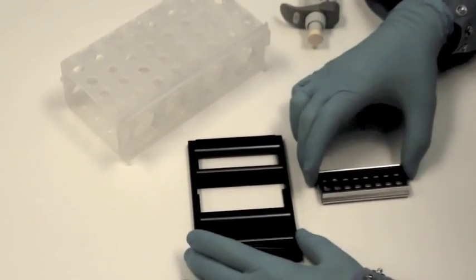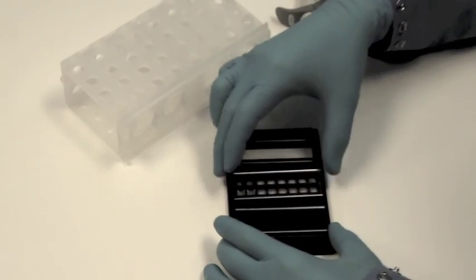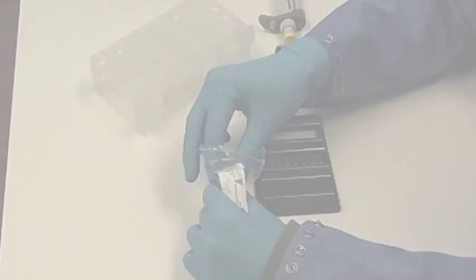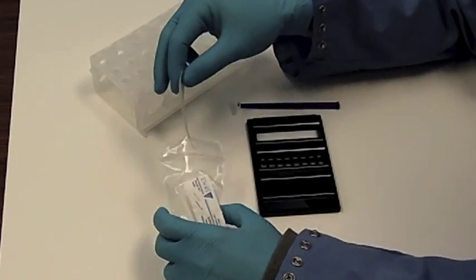When the sample has been applied to each chamber, the entire slide assembly can be placed in a slide tray with a footprint of a standard 96-well plate.